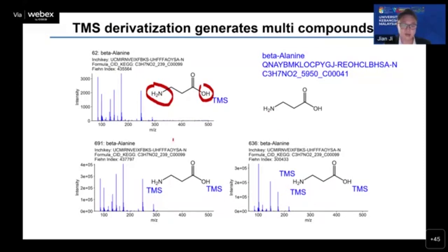So there are several different possibilities, and the number of byproducts is large. When we check the database for how many entries alanine has, you will see more than 3 different EI spectra at different retention times.